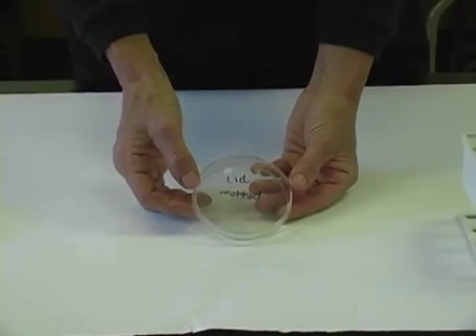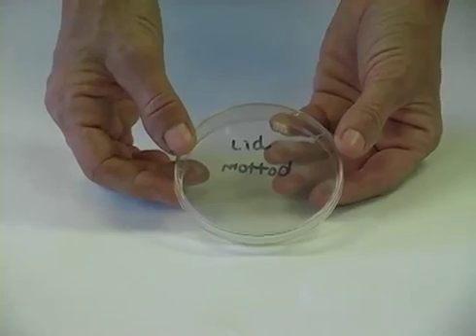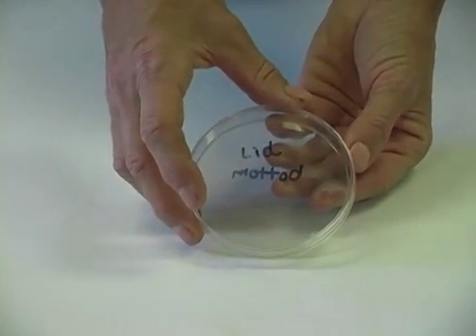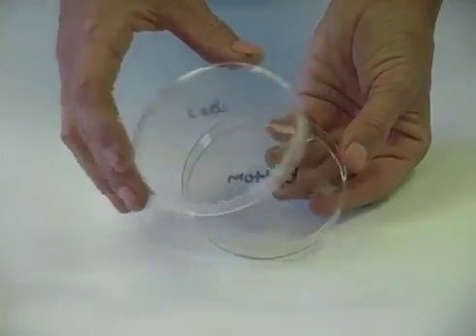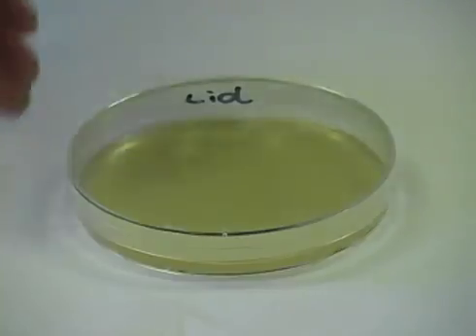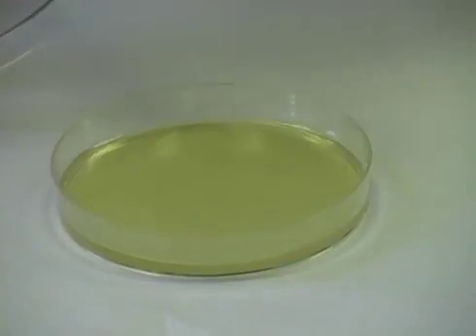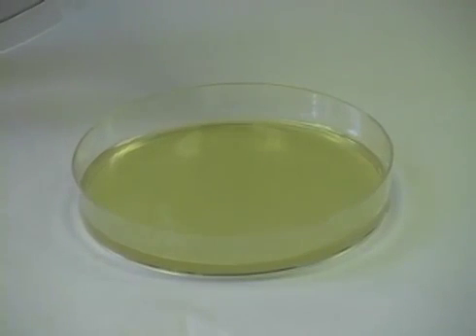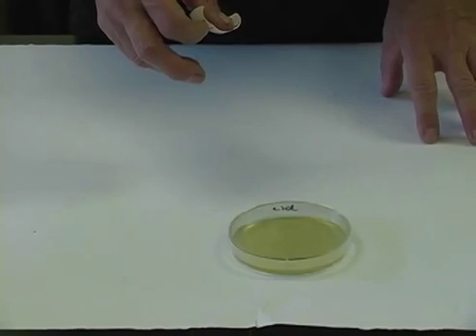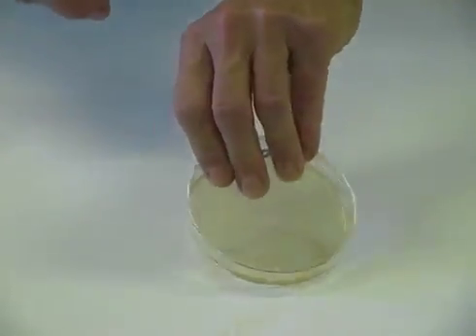Agar may be placed into a petri dish. A petri dish consists of two parts. The wider diameter portion is referred to as the lid. The smaller diameter portion is the bottom. We refer to the dish as an agar plate or a streak plate. And it's on the surface of the agar that we'll place our bacteria so that they can absorb the nutrients and grow. Labels are always placed on the bottom of the agar plate.